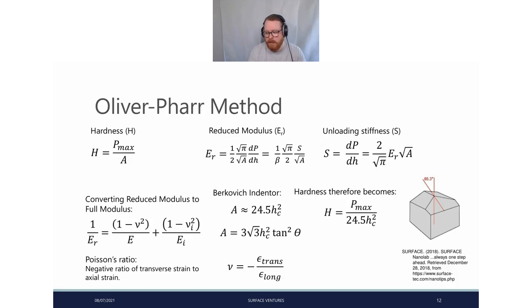our unload line. So quick question there, talking about nanoindentation and hardness, what can be the possible way to quantify the hardness of a material harder than diamond? So there is a very big issue with, as soon as you get into significant proportions of the hardness of diamond, in that you may be deforming the diamond itself during indentation. One of the ways for this is you can do some bits of computational modeling. If you know what the structure of that material is, you can then do essentially a virtual indentation that can help you determine what the hardness is. That would probably be the best I could say right now in terms of how you would even approach that.